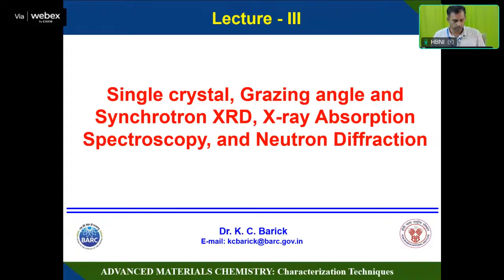Good afternoon. So today we'll discuss a little bit more extension on X-ray diffraction technique that will focus on single crystal XRD, grazing angle XRD, synchrotron XRD, and X-ray absorption spectroscopy. If time permits, we will discuss neutron diffraction.